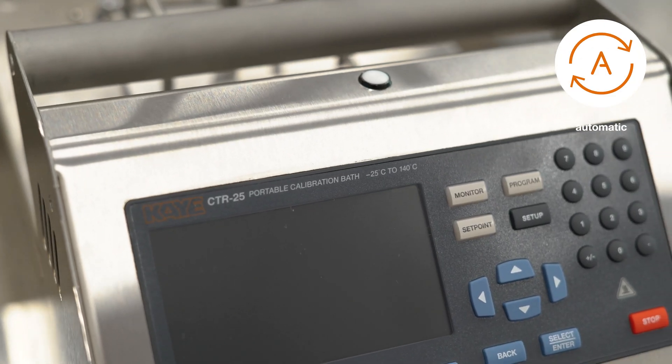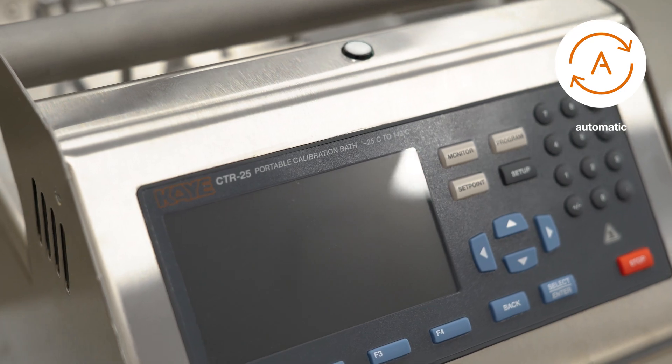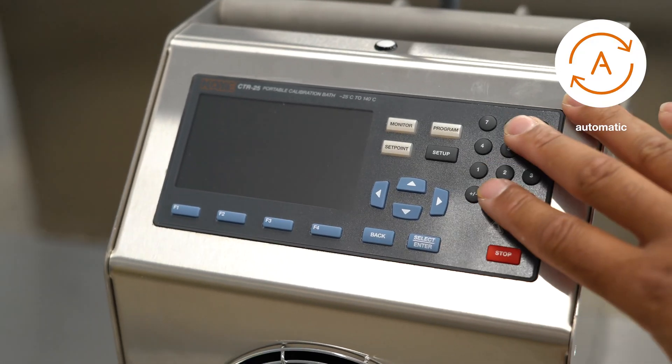All of our Kaye software has the capability to run an automatic verification. Once your setup is programmed, you would then connect to the bath and then the software will actually drive the reference to each set point. As it stabilizes, it will verify the probes and move along to the next set point.